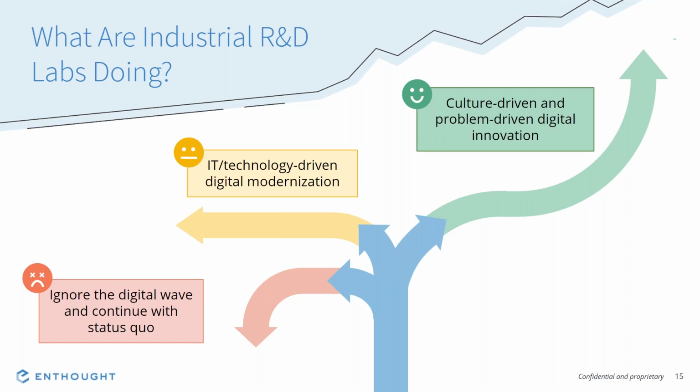Well, some labs want to be innovative and adopt new digital tools, and they see these tools out there with the promise of what they can do. And they take very technology-driven approaches towards implementing change. And we often see that these approaches are highly likely to cause resistance within the labs, within the organization, and ultimately failure.